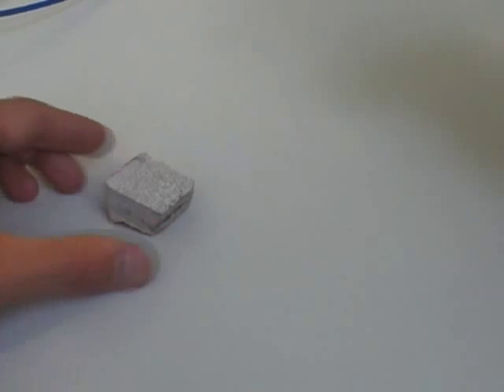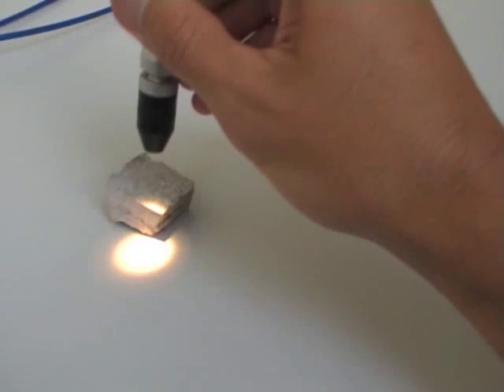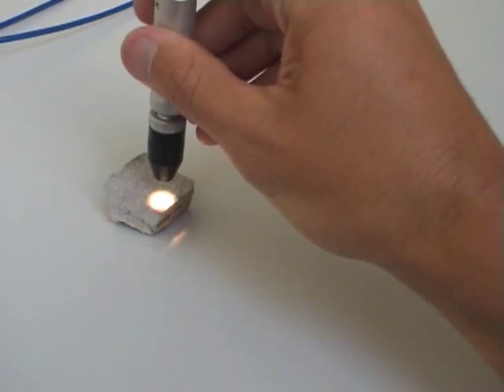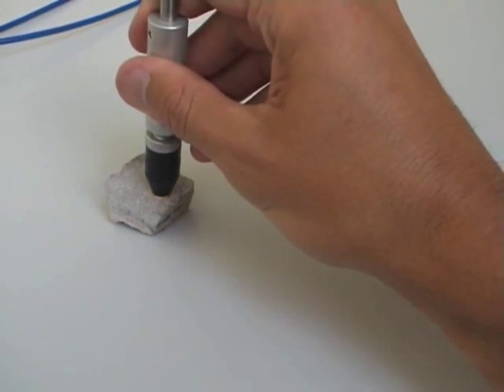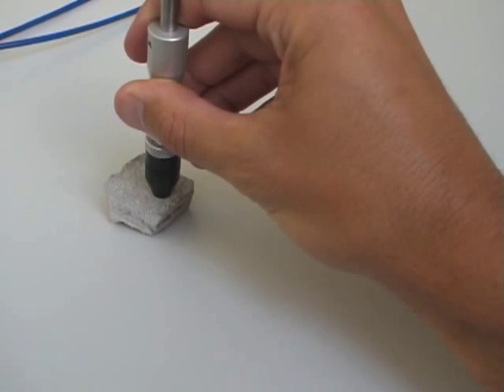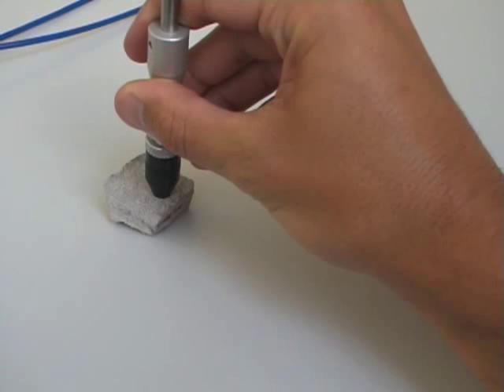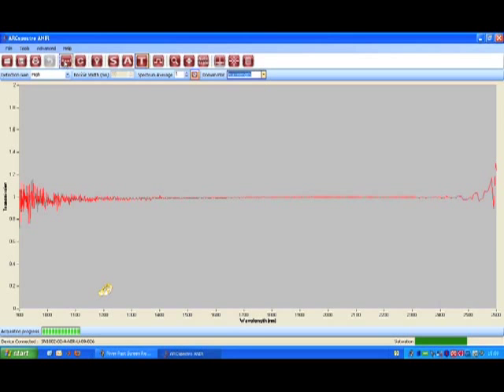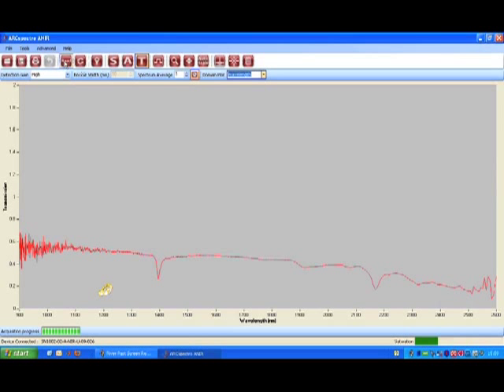To measure your sample, simply press the tip of the fiber probe onto its surface, as you did with the white reference standard. Press the read button and then autoscale.